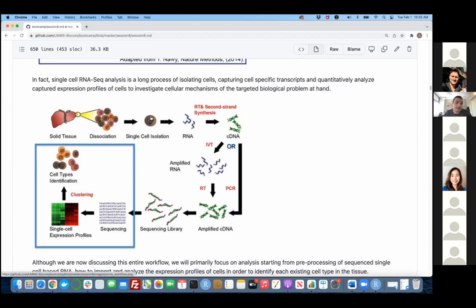But there are methods where you don't really isolate, but you're trying to make sure that the RNA from different single cells are tagged in such a way that different combinations of barcodes and the molecules that we tag with RNA that indicate the cell of origin are actually unique to those RNAs. So there are different kinds of methods. We're gonna talk about all of those.